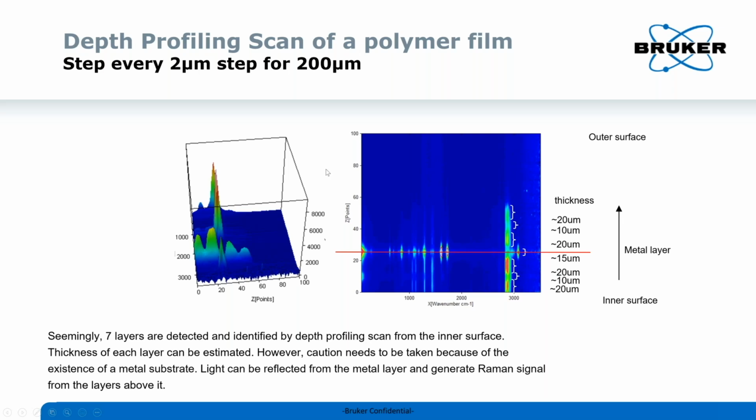Now, okay, depth profiling was really important to a lot of you. 3/4 of you said that it was either slightly or very much of interest to you. So this is one of my favorite samples that we worked on, and my colleague Pong and I published this as a communication a couple of years ago. So now we have 7 layers in this multi-layer polymer film, but it has a metallic backing.